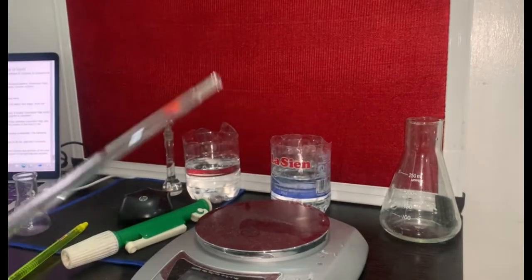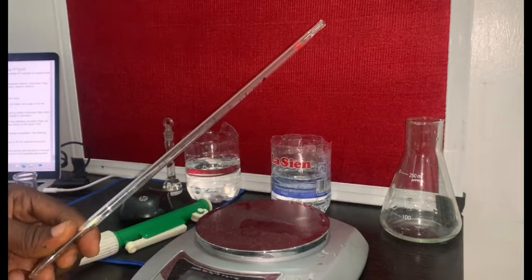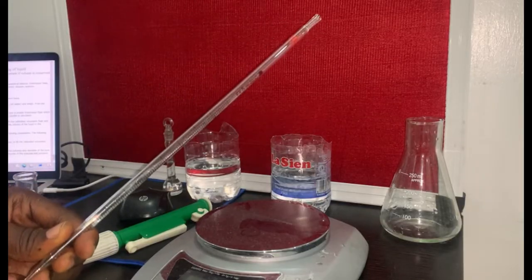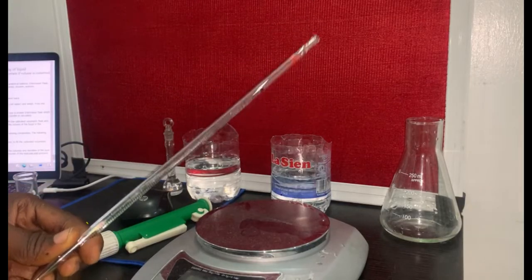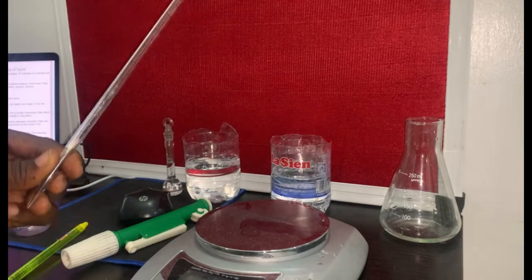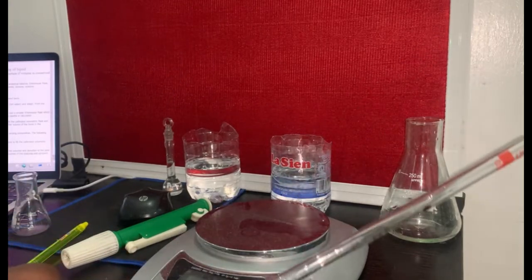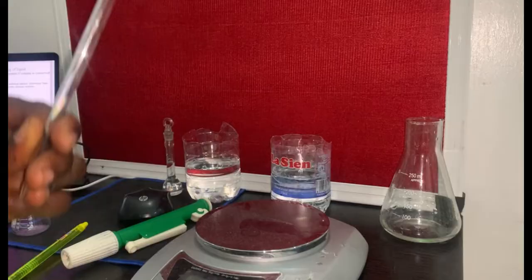That will give you 10 mil. So what I'm trying to say is that you don't really have to complete this 5 times. The 5 times is just to avoid any form of error. If it is 10 mil that they gave to you, they might say do it 2 times. So it's simply going to take 10 mil the first time plus 10 mil the second time. 10 plus 10 is 20, but you have to divide it by 2 because you made use of it twice.